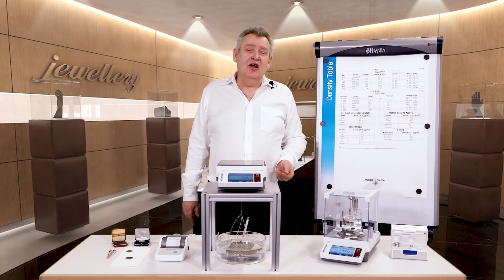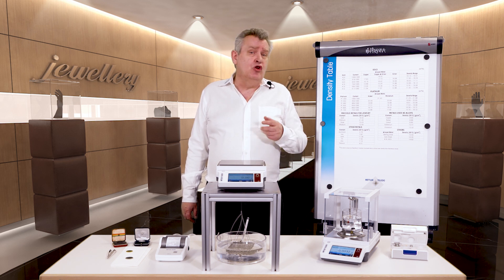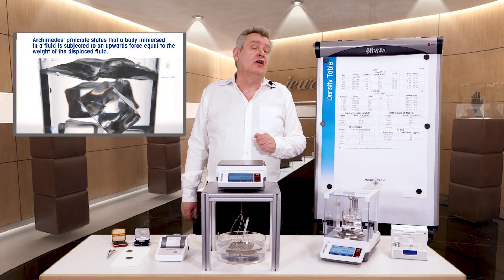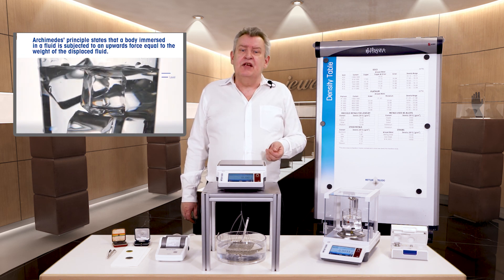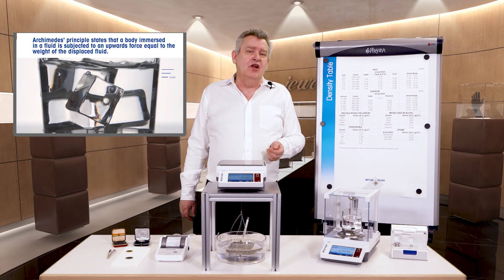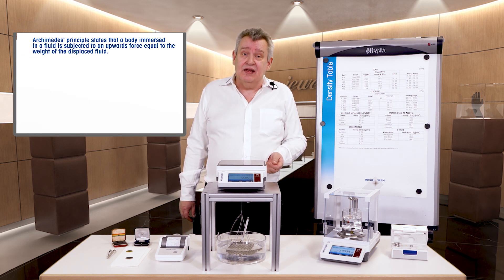Hello and welcome to this short video about using a balance to determine the purity of gold, silver and other precious materials using the principle of Archimedes. In the laboratory this process is called density determination, but in the jewellery industry it's better known as purity determination. Ultimately they both mean exactly the same thing.